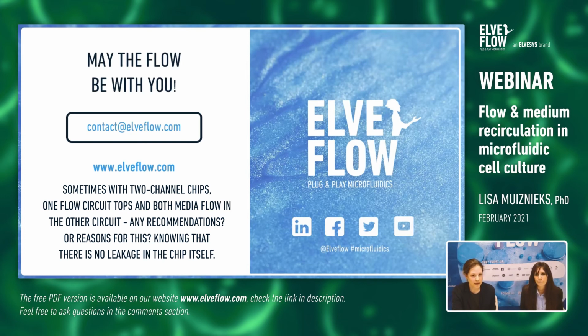If one flow circuit stops and both media flow in the other circuit, then in a two-channel chip, if I understand correctly, this is a stacked channel chip with a membrane in between. There's probably some movement of liquid across the semi-permeable membrane, maybe precipitated by one channel being blocked. The path of least resistance is then to push across the membrane into the other channel. That's what it sounds like to me.